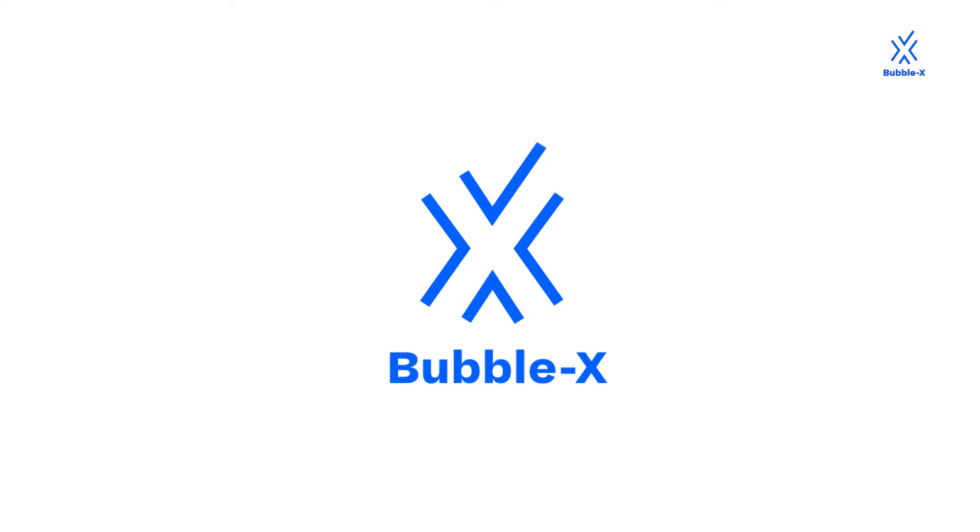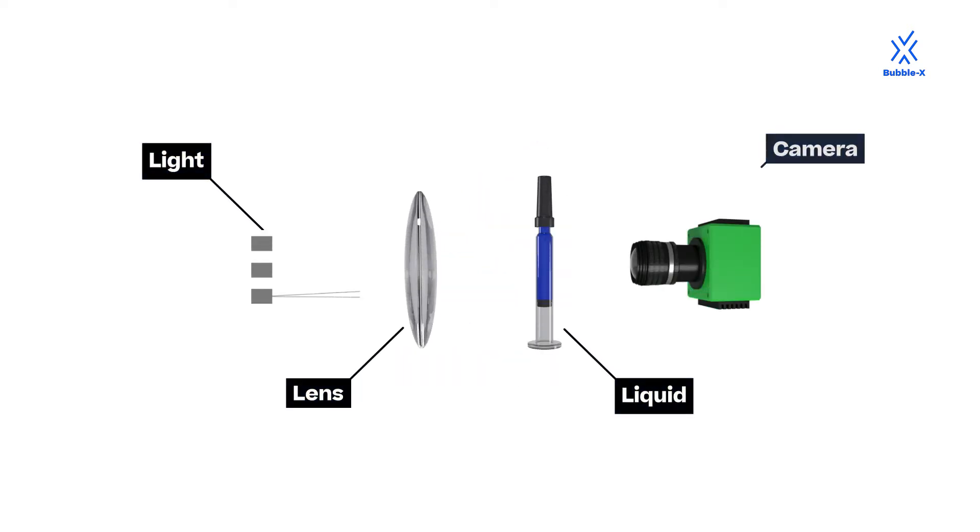During the inspection with Bubble X, light is guided through the liquid and deviations caused by particles or air bubbles are detected.